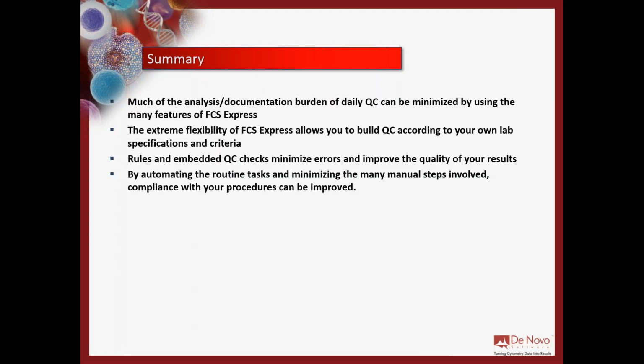So in summary today, much of the analysis and documentation burden of daily QC can be minimized using FCS Express. FCS Express allows you to build the QC according to your own rules, whatever those rules may be.